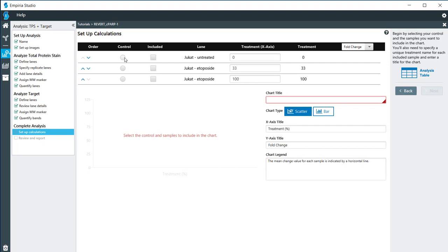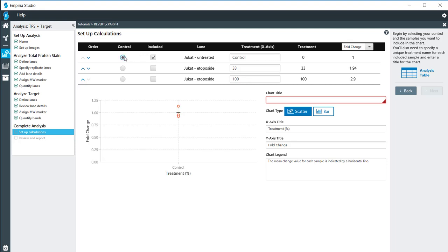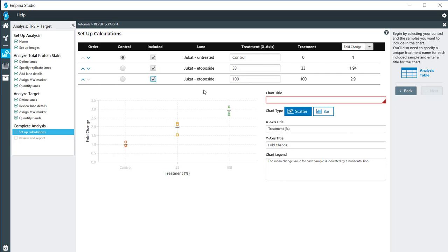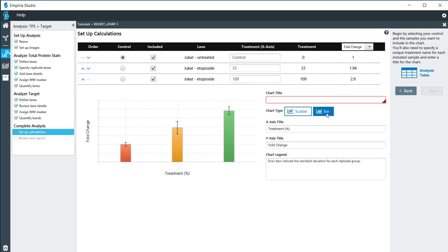Now for the graph, we have to say which one is my control. For my untreated cells, I'm going to say that is the control. Then I also want to include my other replicates, my 33% and my 100% treatment in there. Right now, it is a scatter plot that has the standard deviations within, or I'm sorry, the fold change compared. If I click the bar, here we see that the control is set at a fold change of one.